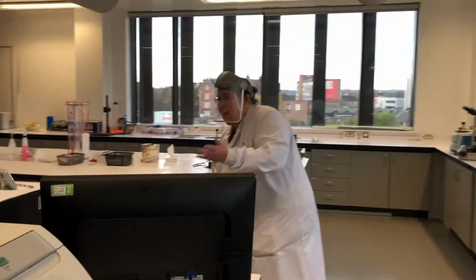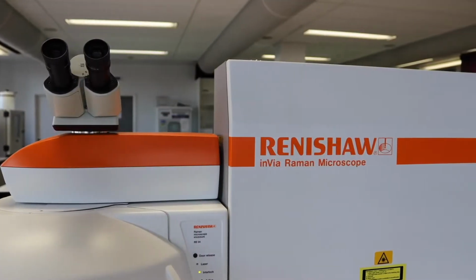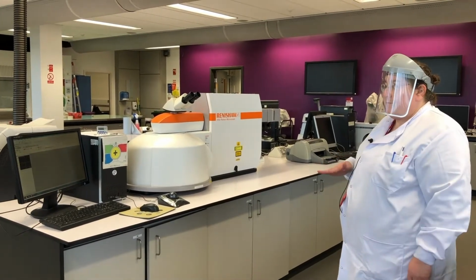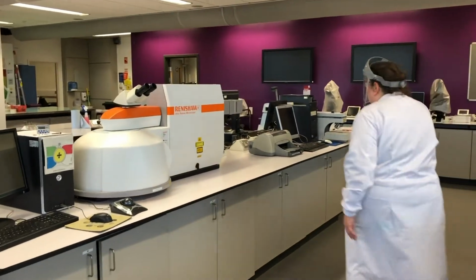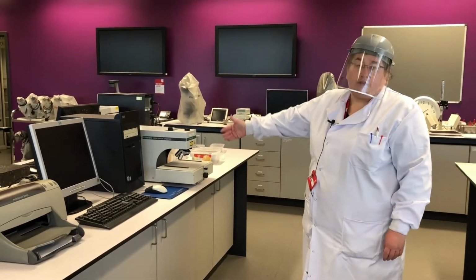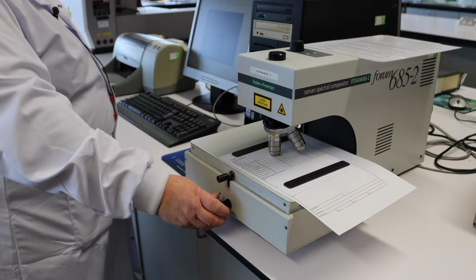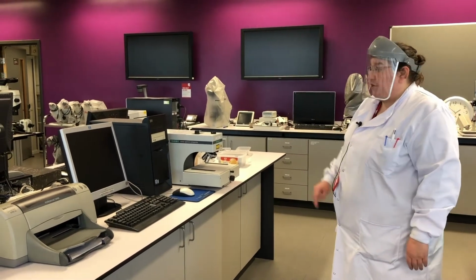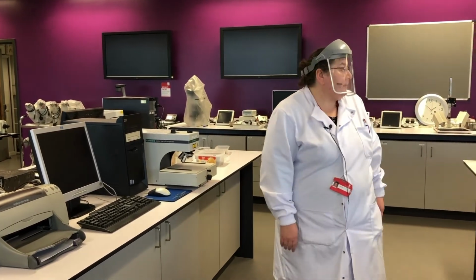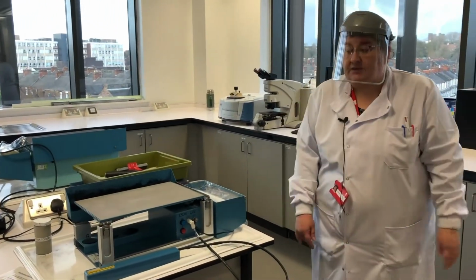We have our Raman microscope, our Raman Renishaw, and this can identify drugs, paints and materials such as that, and we look at the infrared ranges on those through the spectroscopy. We've then got a lower level Raman here, which the students tend to use in conjunction with the VSC. We look at the inks on papers so they can look at the different spectra to see if they match a suspect pen. They can either print their images or they can take them away on a memory stick to put in their report.